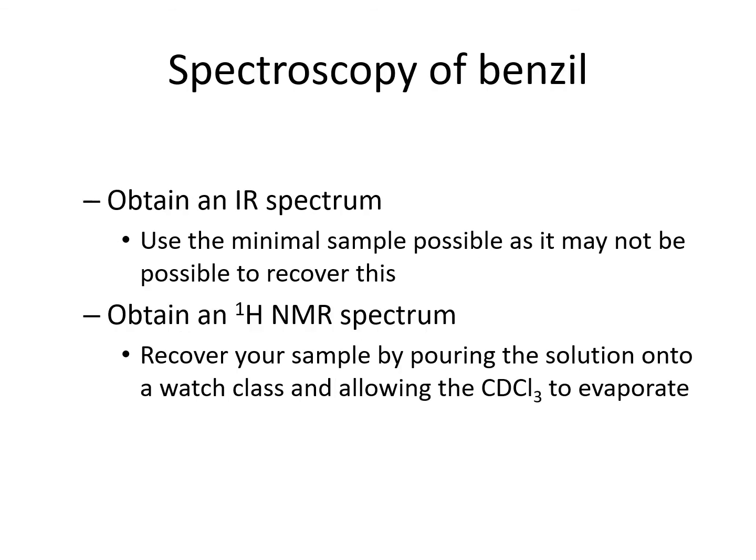As usual, we'll do spectroscopic analysis for our samples. I hope you remember that IR does not recover samples and we need to use a minimal amount of sample, whereas from NMR we can recover our samples by washing with deuterated chloroform.